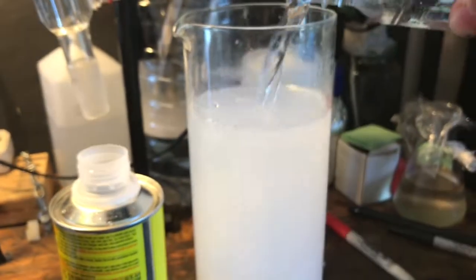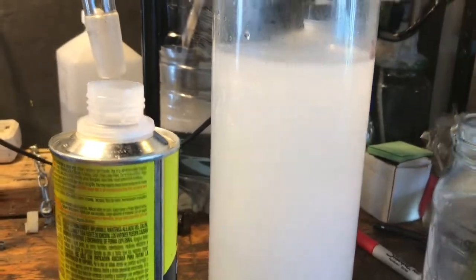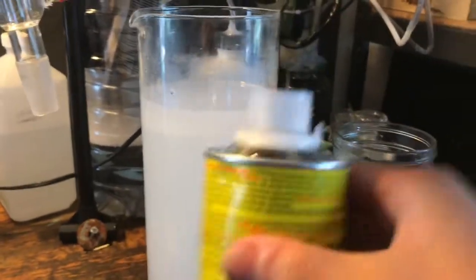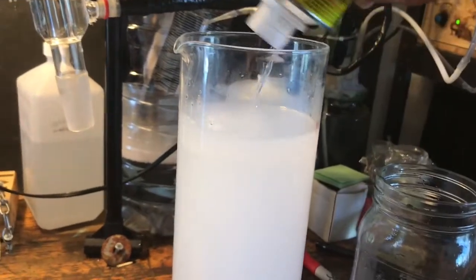As you can see, adding more water does nothing, so we've already separated the acetone out. You can also rinse out the can if you want, but it's sort of pointless, to be honest.